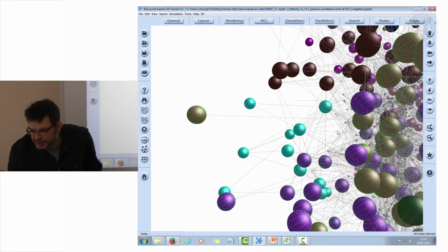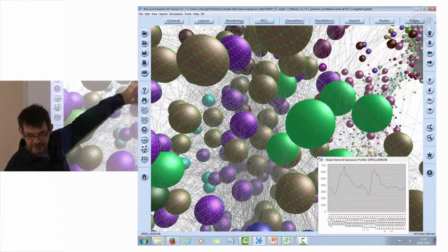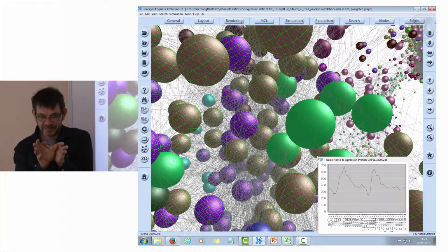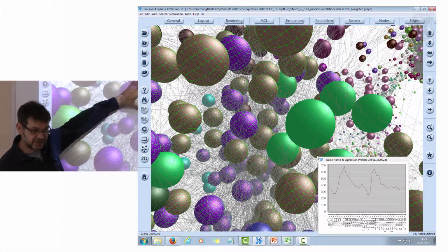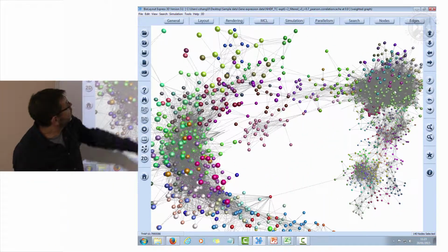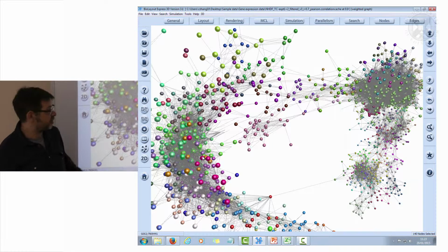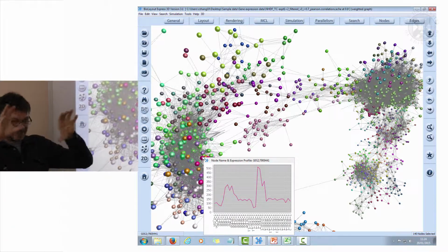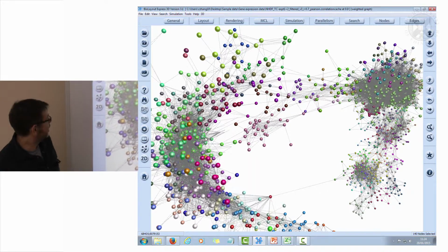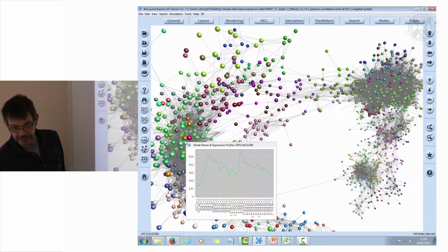See those purple nodes there and those brown nodes? These are two classes which the clustering has separated apart, but when we look at the overall profile of those genes, they're extremely similar, and actually they're situated next to each other within the graph. What's also worth noting is that our cluster 1, which is over here, is very well separated from this cluster over here. So the graph is like a physical map to remember where everything is within this world. And if you put your mouse over any given node, it'll give you the profile of that specific node.